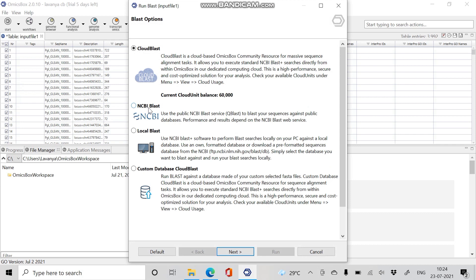NCBI BLAST is an open source which allows searching molecular sequence databases with BLAST algorithm. The main advantage is no database is required. Local BLAST allows searching against our own database. Custom database Cloud BLAST allows users to run BLAST against a database made of their own custom selected FASTA files. Here I am going to use database as NCBI BLAST and give Next.